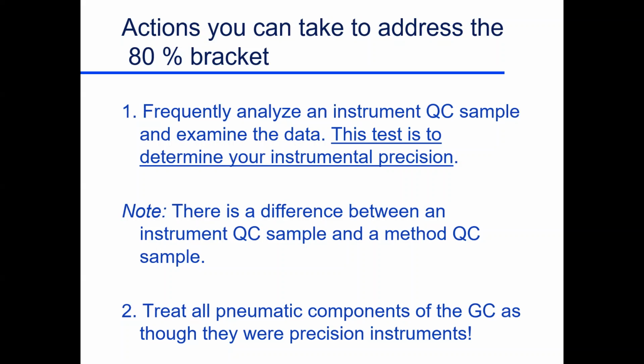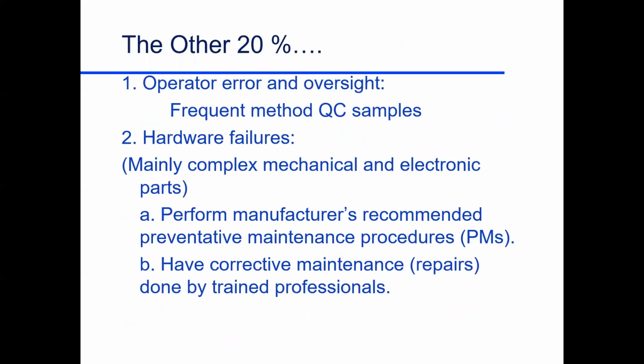These systems, we've got 3 different gas tanks connected to them. The carrier gas or mobile phase, the air, the hydrogen, and so on. And I think I mentioned that before. These are all sensitive instruments. There are knobs on the front to change the flow rates, to direct the flow, and they're all handled with a great deal of care. They're never tightened down tightly. It's always gentle. They are sensitive instruments. One of the first things people do is crank that one down. "Oh, I'll close that one." No, you do it gently.